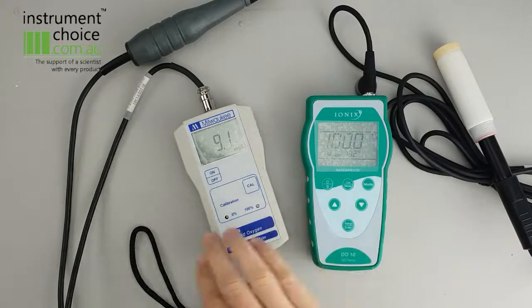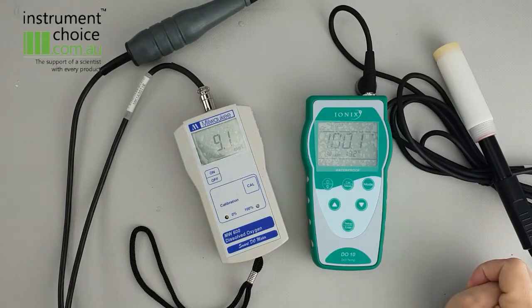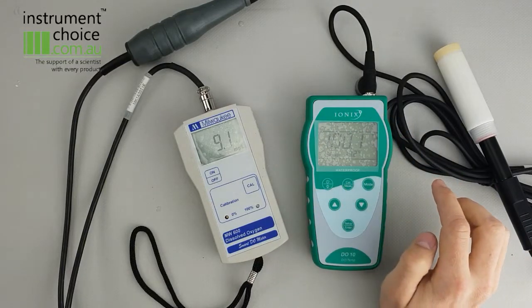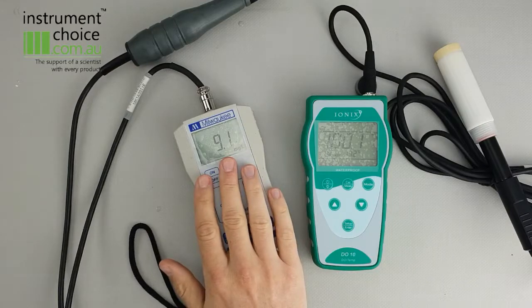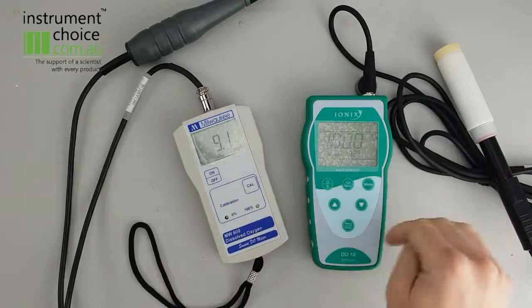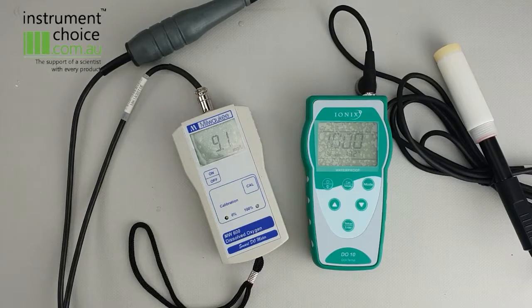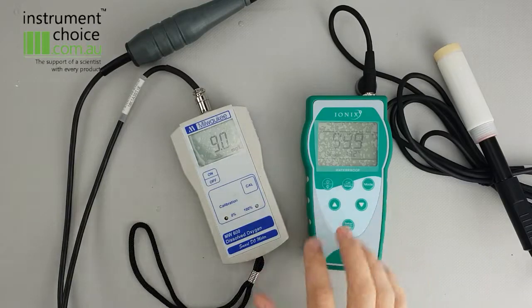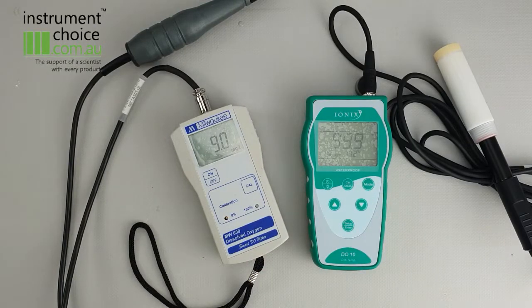So as you can see, the difference between the two in terms of their calibration procedures is quite immense. This one is also really good for lower value or lower flow samples, whereas this one is better when you've got a flow or a larger sample. So both of them are good units — this one obviously reduces your maintenance and downtime along with being simpler to calibrate, whereas this one is obviously lower cost. Both are good options, but if you do have any questions about either option, please feel free to give us a call on 1300 737 871 or email us at customer-service@instrumentchoice.com.au. Thank you.